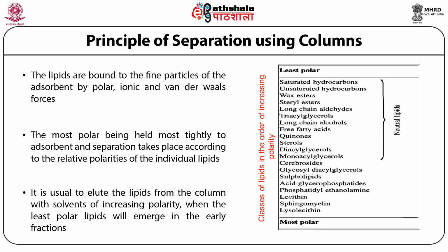The least polar lipid is saturated hydrocarbon, so it will emerge first, while the most polar lipid is lysolecithin, so it will emerge later in the fractions.